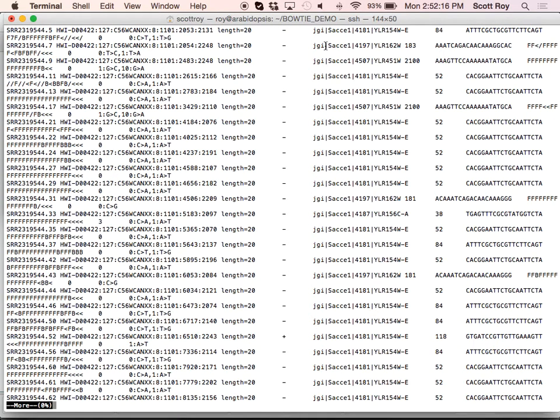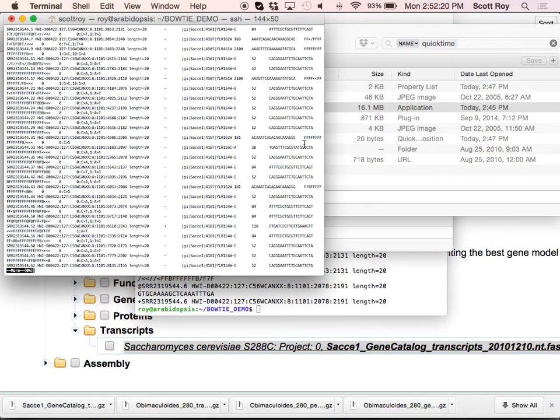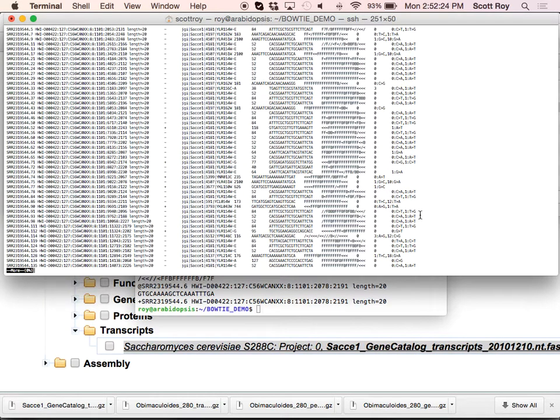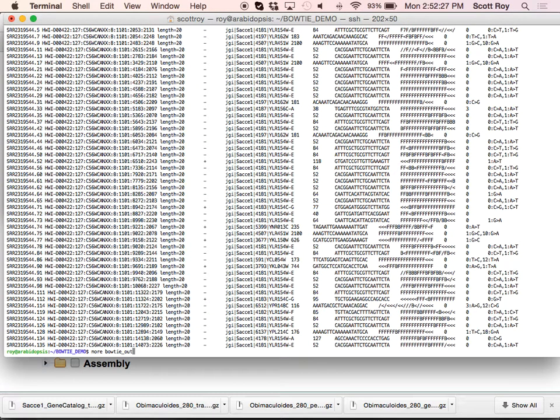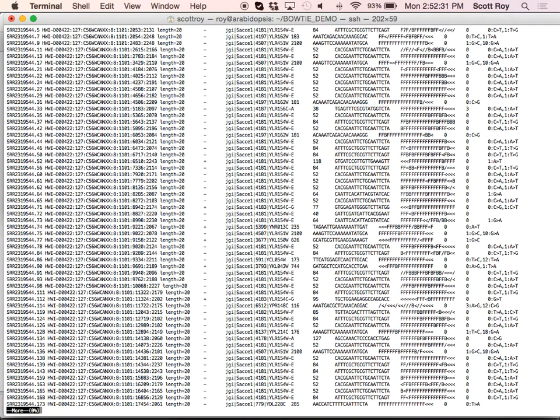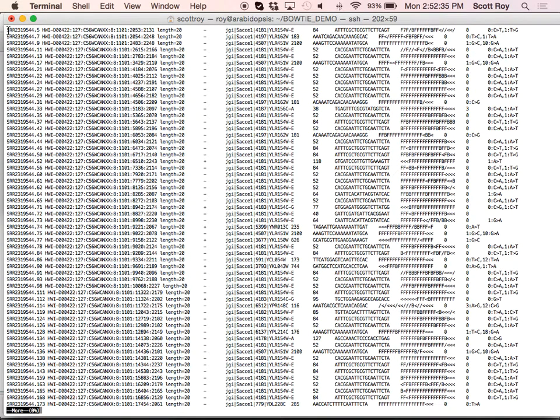So I'm going to shrink the screen down a little bit so that we can get this looking reasonably. Sorry that the text on my computer is doing something funny. I apologize. It's not more readily readable.